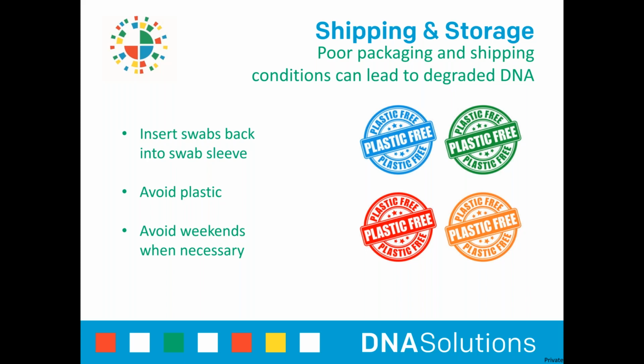In doing so, you often trap moisture. Humidity and moisture can lead to bacteria or fungal growth, which can inhibit a sample from being successful. This includes placing paper sample envelopes into plastic Ziploc baggies. Often this causes samples to be moist or entirely wet upon arrival to our facility, and typically will result in a failed or partial profile.